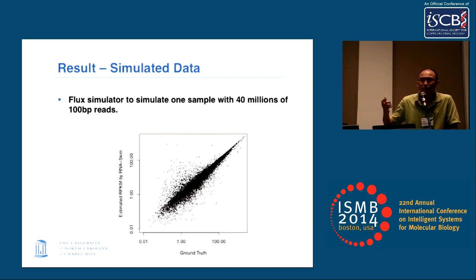For the sigmers, they will belong to multiple transcripts, and it's the same approach as in the alignment methods. Through the EM, we can redistribute the weight of sigmers to different transcripts and disambiguate the probability. The quantification model is the same as the other methods. So what you would do for the multiple alignment problem, you still want to do the same thing with the sigmers, and that's exactly what we did.